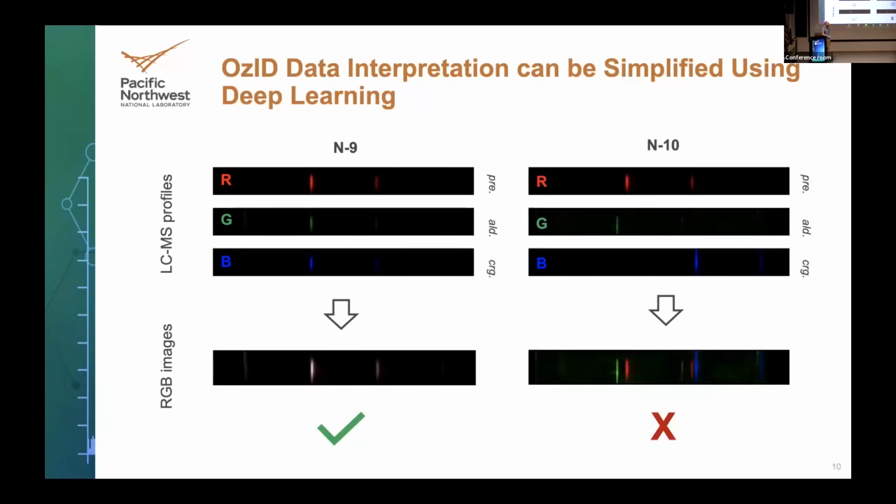In this case, we just feed these RGB images directly, and we let the model decide what in any of these channels it wants to key in on and activate strongly from. That's the benefit of these deep neural network architectures.